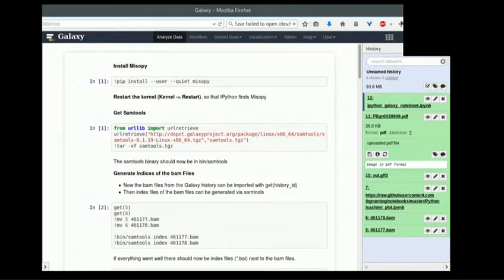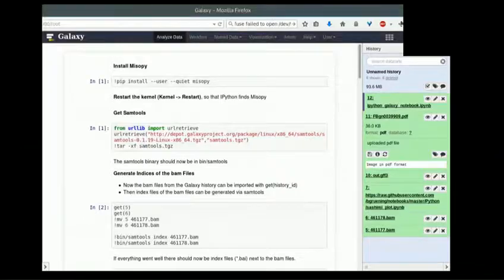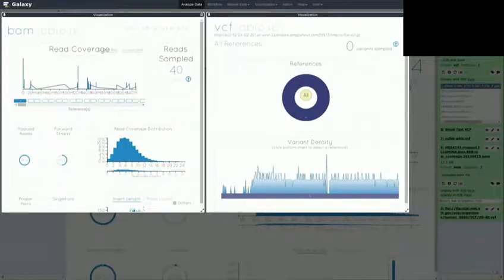Yeah, and we needed to solve this. With Galaxy and this Docker, we were able to do that. Quite interestingly, that enabled a lot more possibilities than we expected at the beginning.